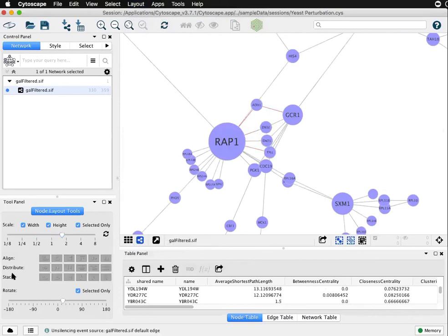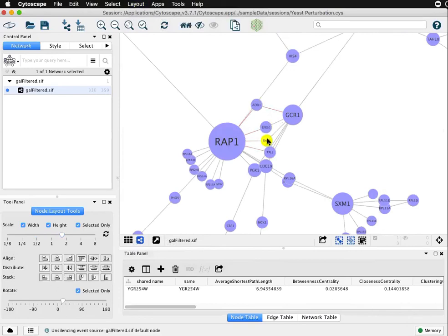There's all the align, distribute and stack options that you'd expect to see whenever you have one or more nodes selected.